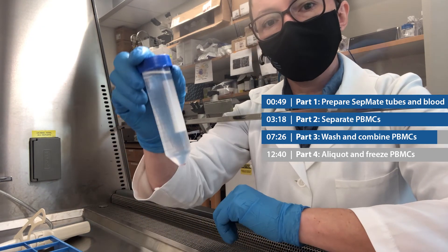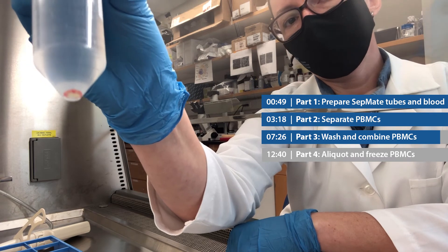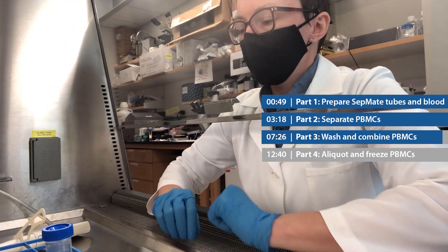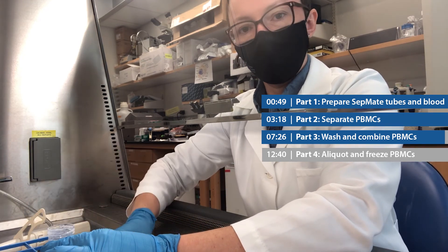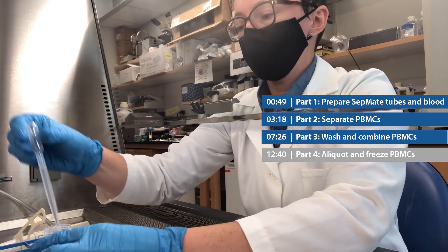My cells just came out of the centrifuge. You can see the pellet there — it's a little bit pink, there are a few red blood cells, but that's all right. I'm just going to remove that supernatant, being careful not to disturb the pellet, and then I'm ready for part four.